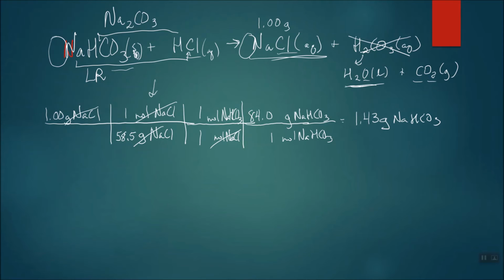So how in the world are we going to go from a watery solution of salt, sodium chloride, to solid sodium chloride? Do you know? Well, what if we heat it up and boil all the water away? The sodium ions and the chloride ions have nowhere to go. They can't leave with the water, so as the water leaves, it'll leave behind the sodium chloride solid.